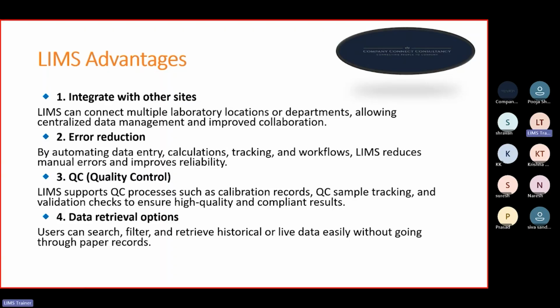If the specification mentions the sample weight as 10 gram, and we give the tolerance of plus or minus 2 grams, so now we have provided the tolerance as 8 gram and 12 gram. So let's say the analyst enters the sample weight as 15 gram. Now the system will not accept that. The system will give an error. It will not save the results.